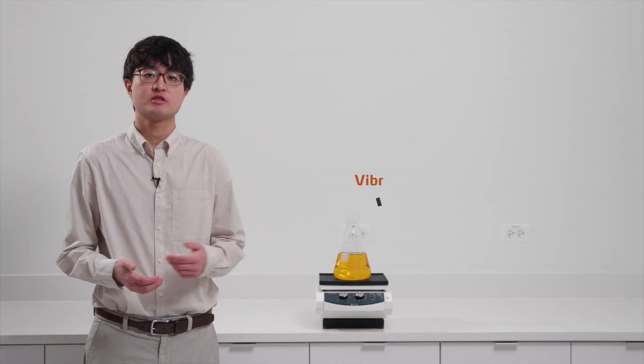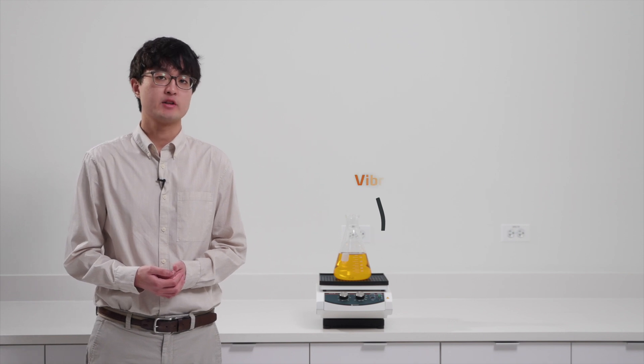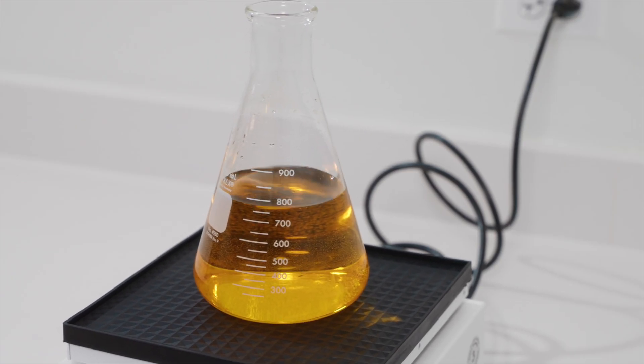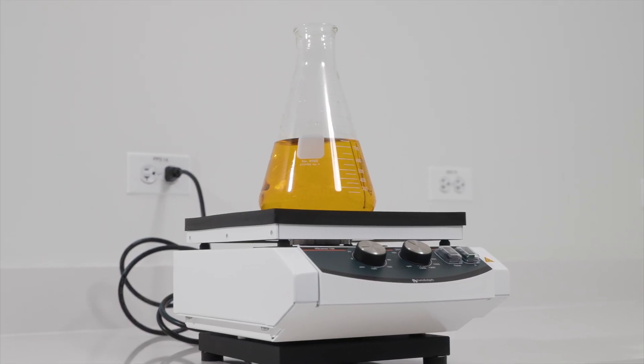If you want a platform shaker more suitable for other types of glassware, then the Vibramax 100 is the model for you. The Vibramax 100 shakes at speeds between 150-1350rpm and has a vibration orbit of 3mm.